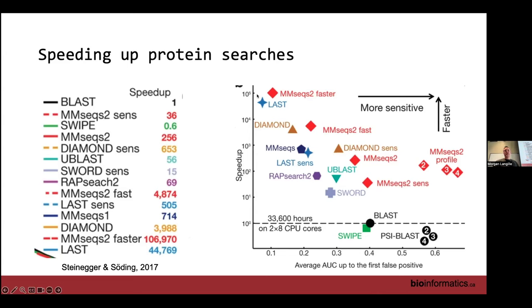I sort of don't. Yes, Monica. Are there any big arguments why you wouldn't carry out a CLR transformation on metagenomic data? I don't think so. No, there's a real lack of discussion around it. Considering how much discussion went on in 16S, with people battling back and forth, metagenomics seems to be quite silent. I Googled this yesterday, and I found an old email thread from 2017 where I was discussing it. I reread my response, it was insightful. But there's not much discussion since then, amazingly.